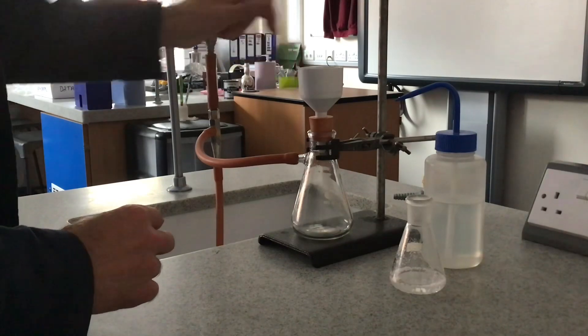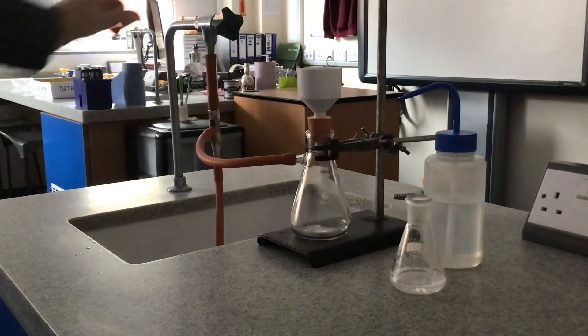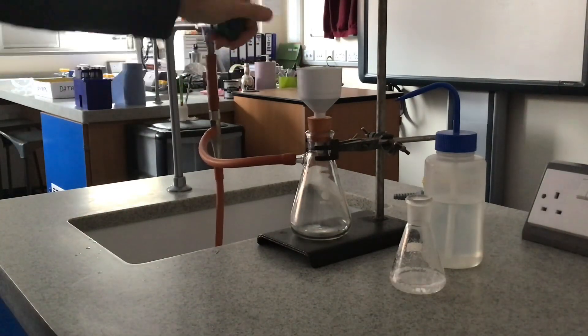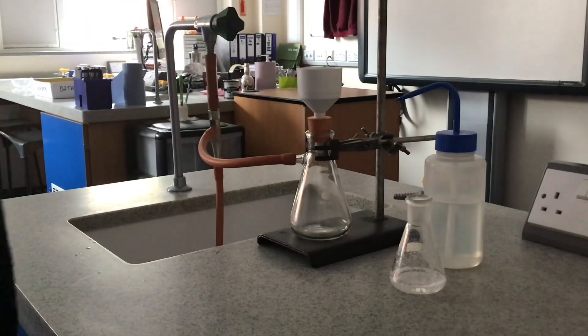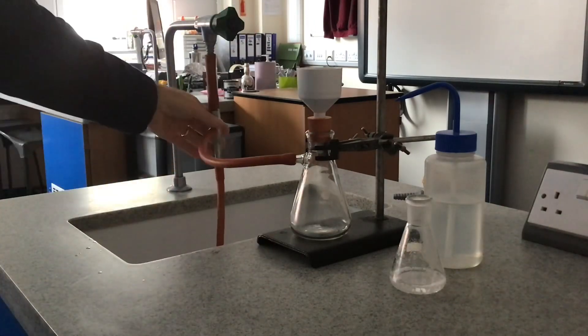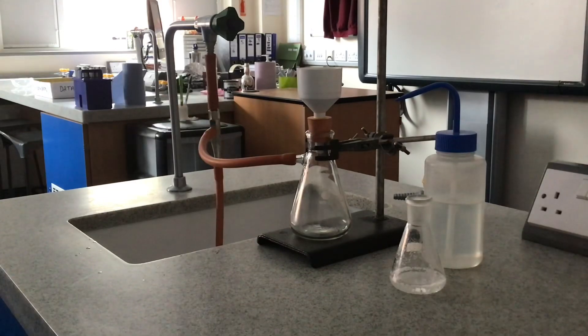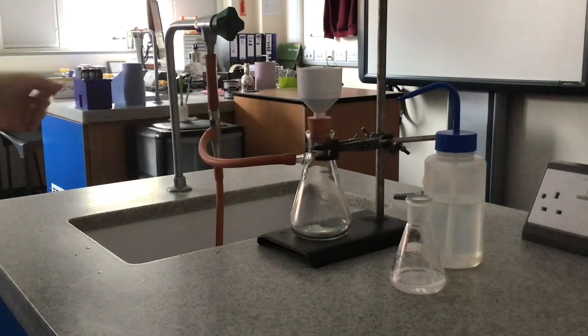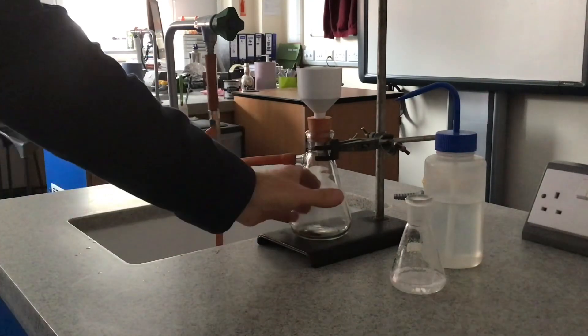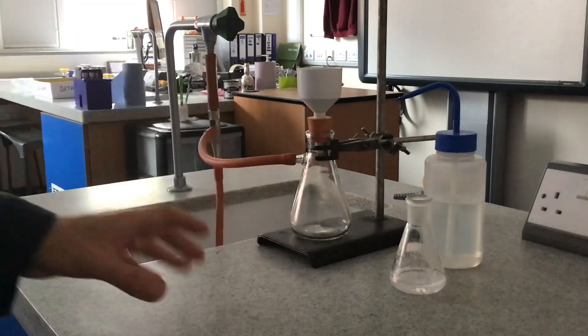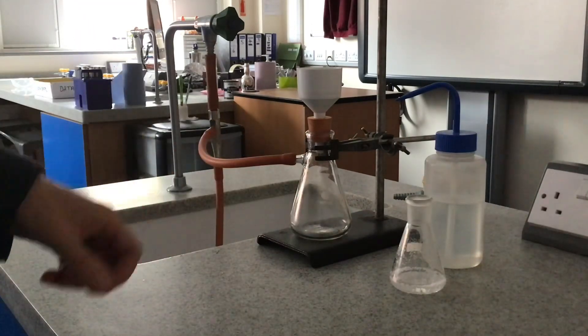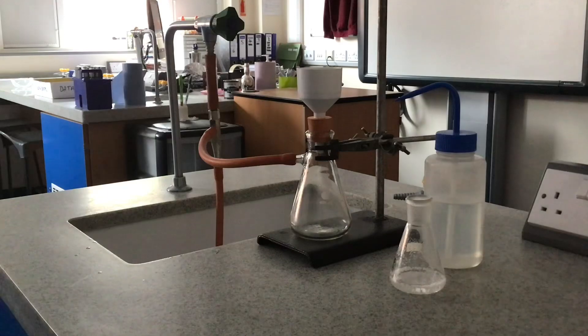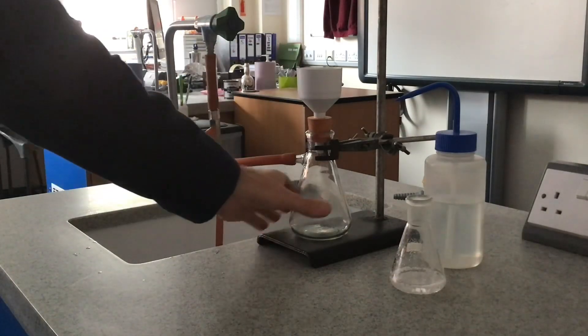I'll just turn the water on now. I'll explain how this works. We've got water rushing through in this vertical direction through this pump here. It's pulling air out of the flask, so we're creating a vacuum inside here. We've got a pressure gradient like I said at the start. We've got high pressure up here, low pressure in the Buchner flask.